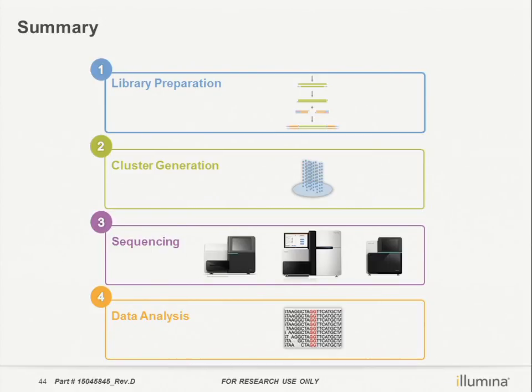Okay. So how many of you are doing dual index sequencing? One. So the rest of you are single index. So that means, how many samples are you? Usually 16. That's usually used. Right. So no problem. No questions.